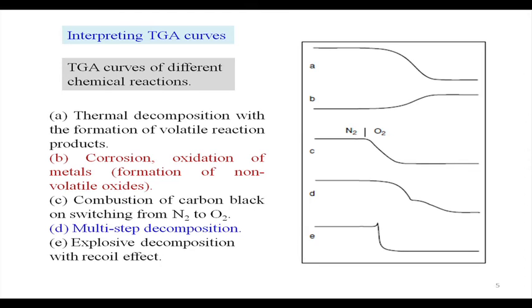A sand bath has a particular temperature of 300 to 350 degrees centigrade, and at that temperature we give the corresponding complex formation reaction by solid state fusion reaction. But we should not have any volatile component of that particular complex which can go out from the medium.